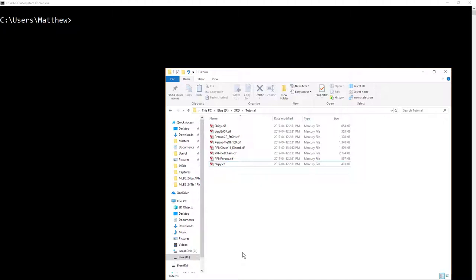If you wanted to use a separate authorship block, I don't, but you might, just make a file author.cif and include it as the first CIF that you merge.